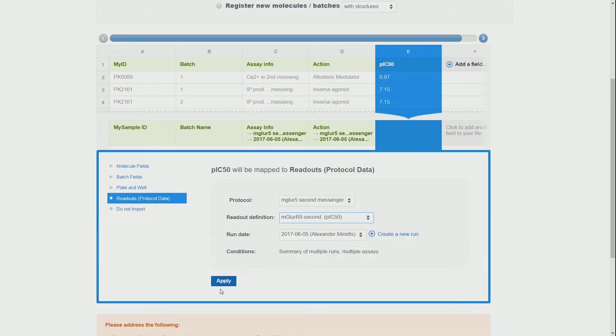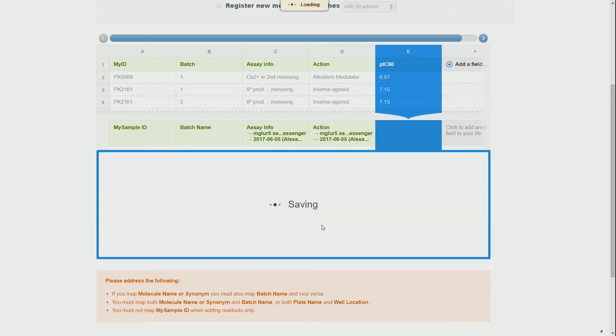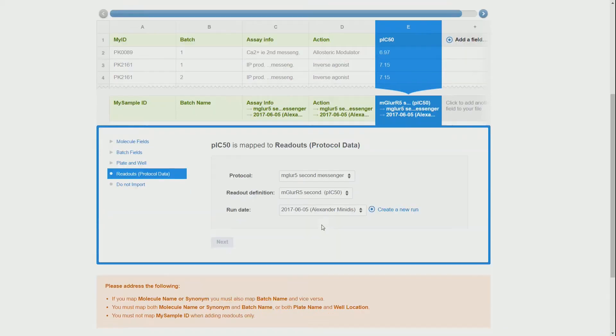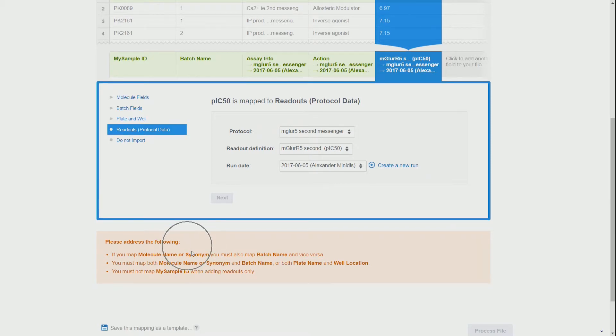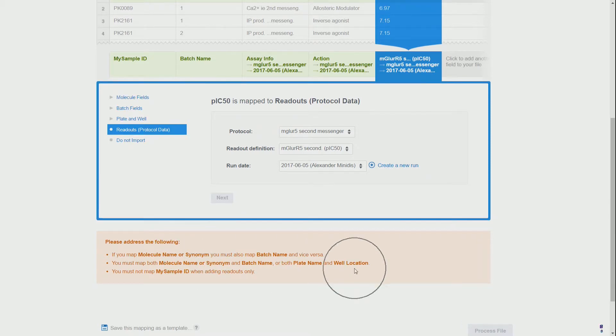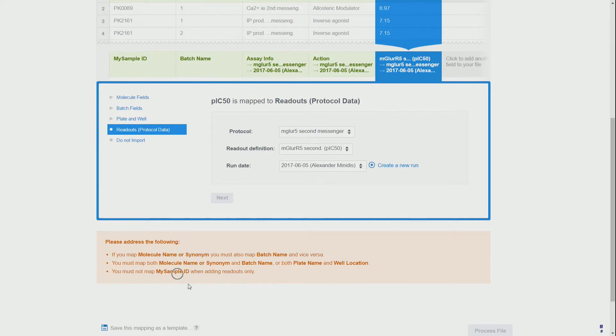Now we actually see a problem with the import, and we could have probably noticed that before if we would have scrolled down. In this case we have a 'you must not map my sample ID when adding readouts only' error.